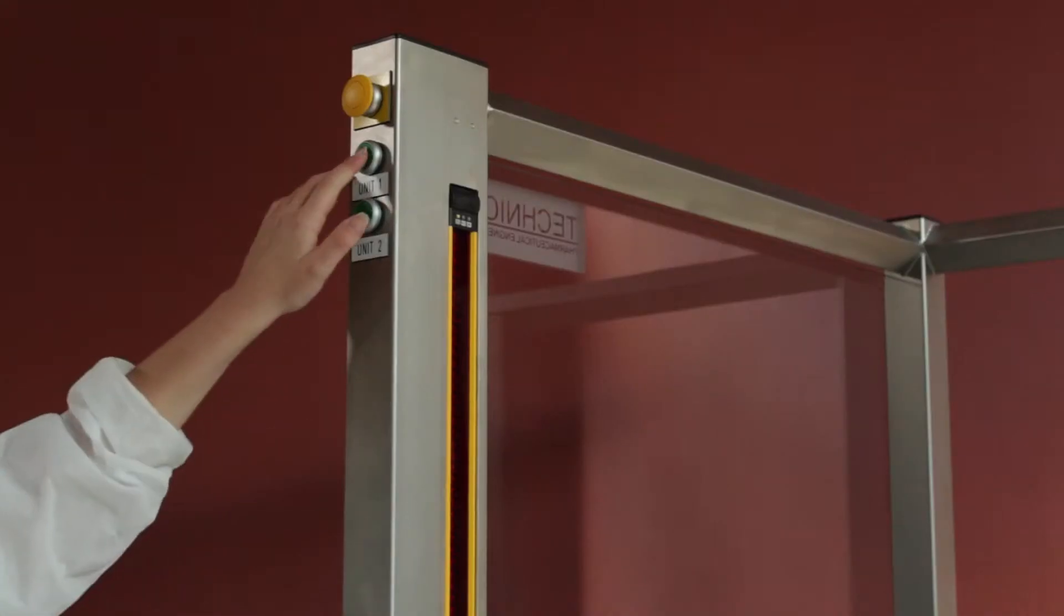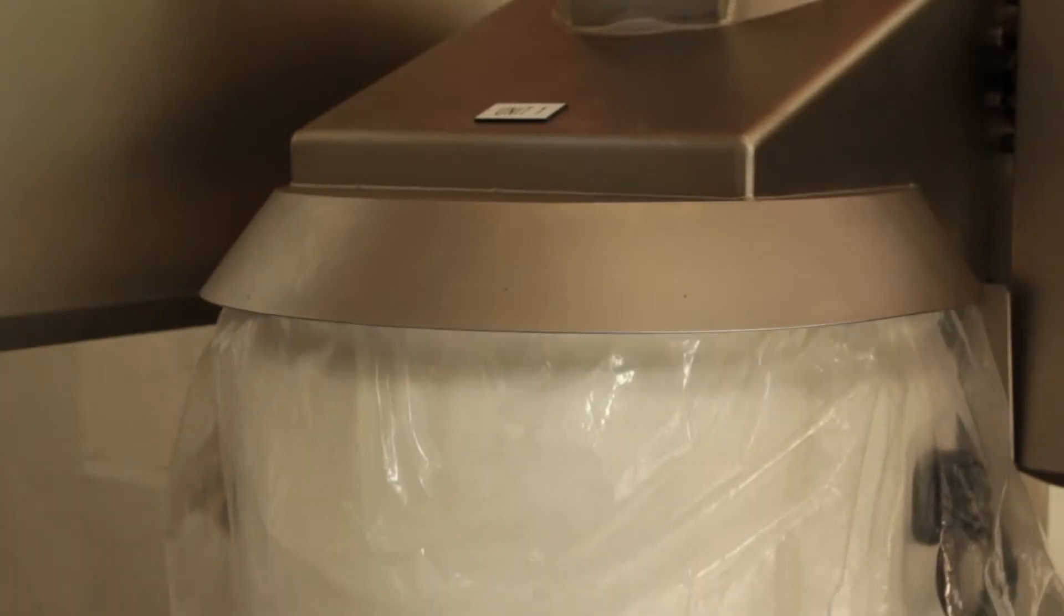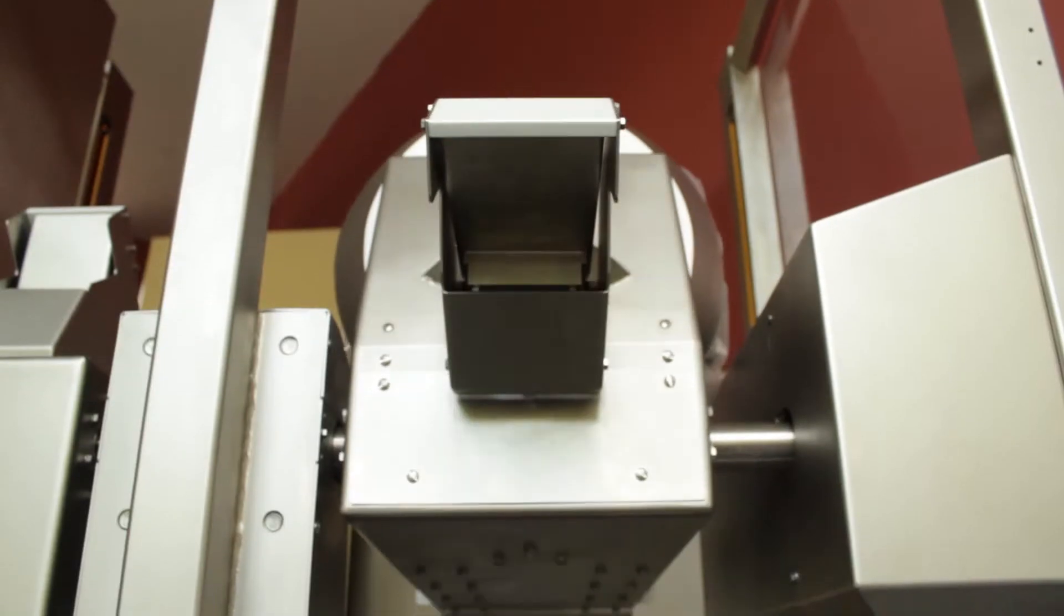After pressing the button on the loaded unit, the drum is pushed against a funnel which closes the drum dust tight.